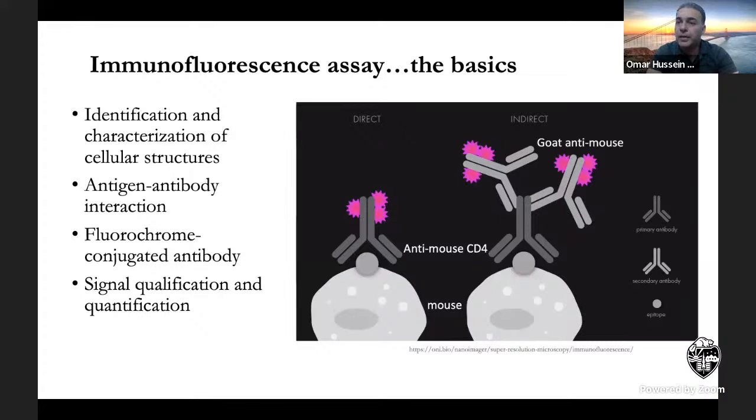Means you haven't washed them after DAPI and put PBS? No, I haven't. I was using intracellular proteins, so my cells were already fixed and permeabilized. I don't have to fix them again because they were fixed earlier on. And what kind of fixative solution? I think formaldehyde was in there, but I used a kit from the manufacturer. The kit has its own. In fact, it's really very easy.